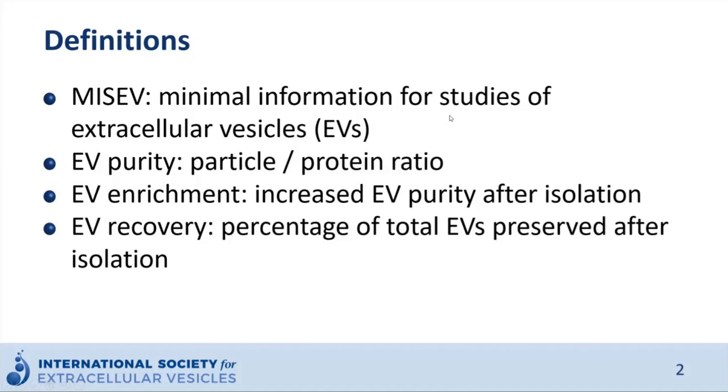For these sample types, we expect to remove as much high abundant protein as possible to increase the EV purity, which gives a higher particle-protein ratio. For EV enrichment, we expect to see increased EV purity after a certain isolation. The EV recovery represents the percentage of total EVs preserved after isolations.